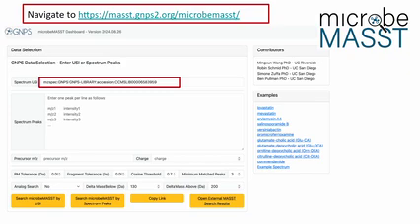Here you can also refine those parameters eventually. If you want to go lower on the fragment tolerance, or higher on the cosine score, you can also modify, but just for this presentation, keep everything as it is. Then you also have the number of matched peaks that you want. If you're looking at bile acid molecules, we know they have a lot of fragments, so I can go to 6, 8, even 10 peaks to have a good match. So that will increase that number.